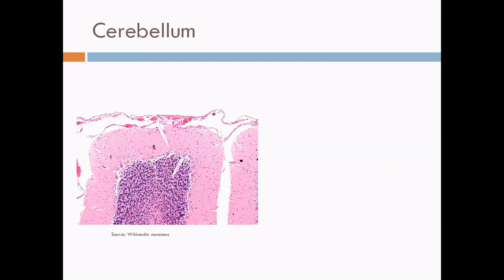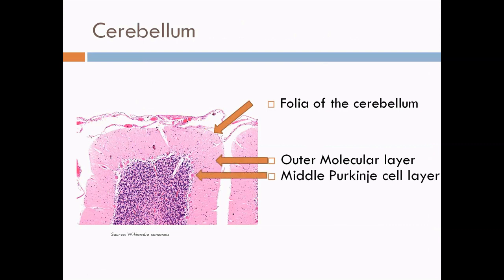This is a section through the foliar of the cerebellum. We can see that there is a layer of pia mater which covers the surface of the cerebellum. The outermost layer of the cerebellar cortex is the molecular layer. Internal to this is the intermediate or the middle Purkinje cell layer. This is followed by the innermost granular layer. Next to it is the white matter. The white matter contains the fibers which are efferent and afferent from and to the cerebellar cortex.